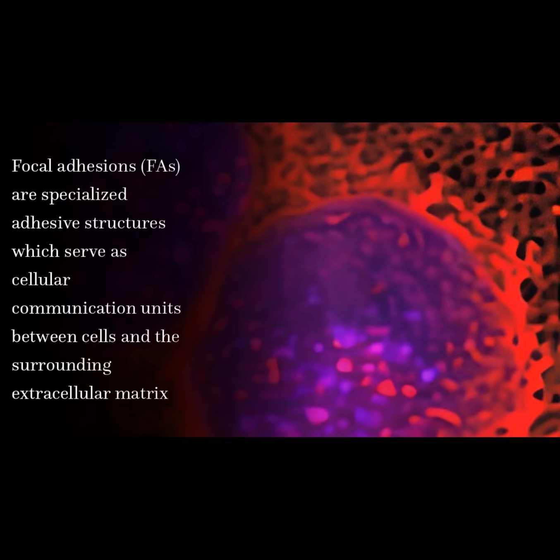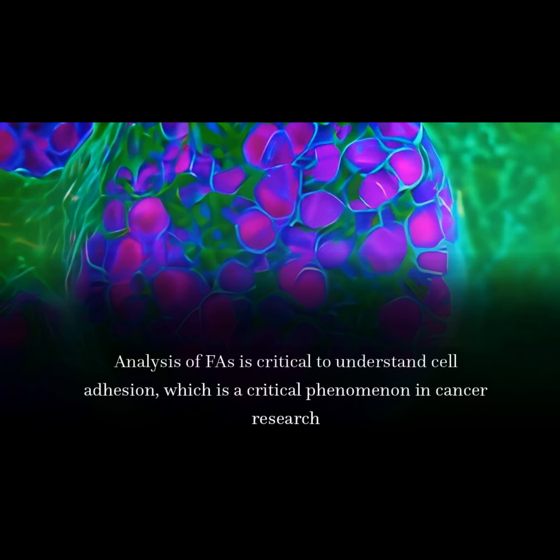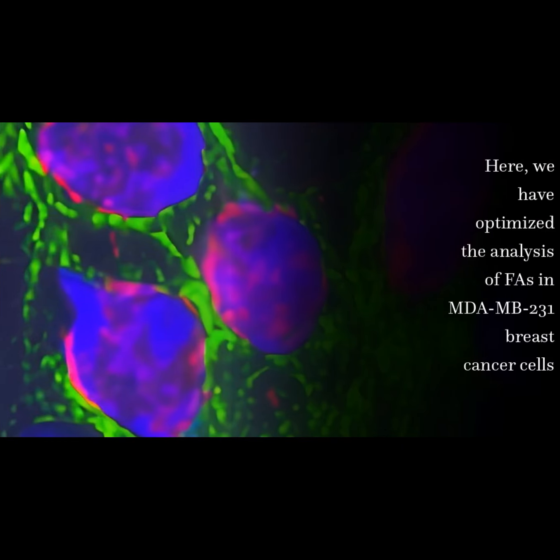Focal adhesions, FAs, are specialized adhesive structures which serve as cellular communication units between cells and the surrounding extracellular matrix. Analysis of FAs is critical to understand cell adhesion, which is a critical phenomenon in cancer research. Here, we have optimized the analysis of FAs in MDA-MB-231 breast cancer cells.